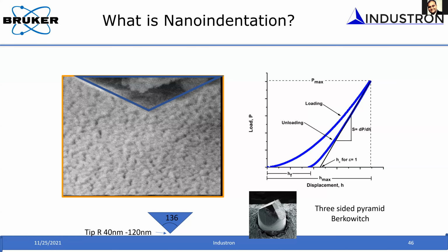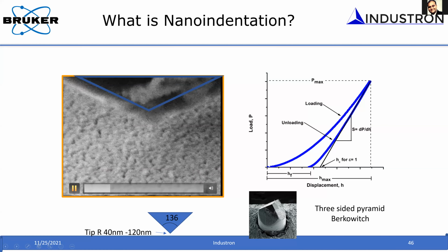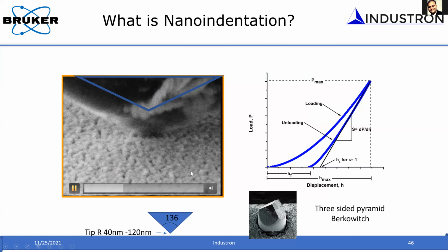What we covered in the first webinar. In the first webinar, we presented the basics of nanoindentation, particularly how one can do nanomechanical testing with the instrument indenter, where you bring a diamond probe, apply a force onto the sample surface, and measure the load displacement response through the transducer.